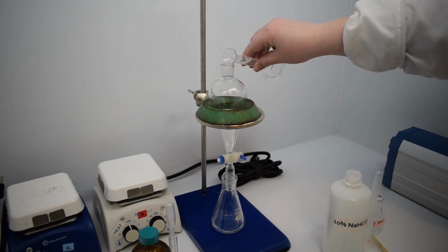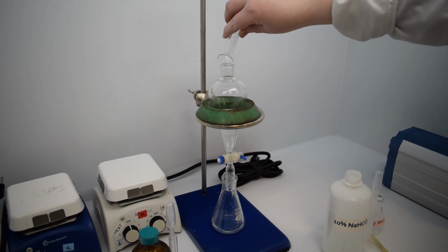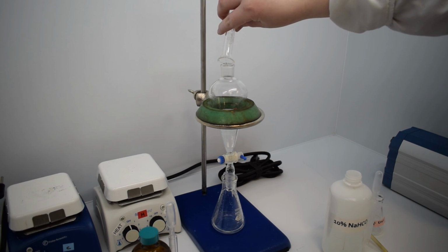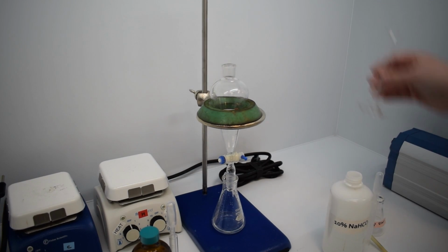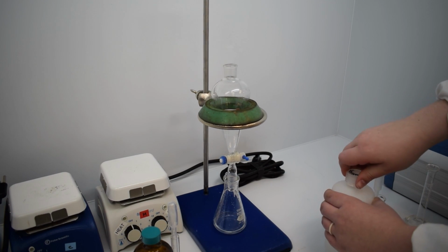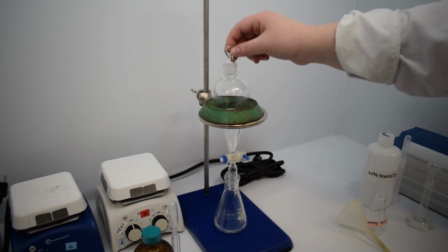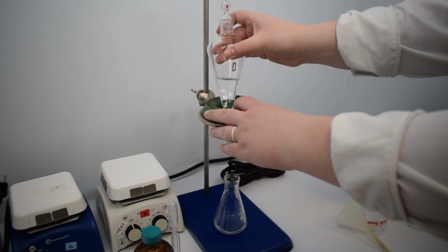After drawing off the first aqueous layer, we've gone ahead and added 10 more milliliters of sodium bicarbonate to the separatory funnel. We are going to repeat the process of shaking and venting as described earlier, again beginning with an inversion and then slowly working our way up to shaking the funnel.